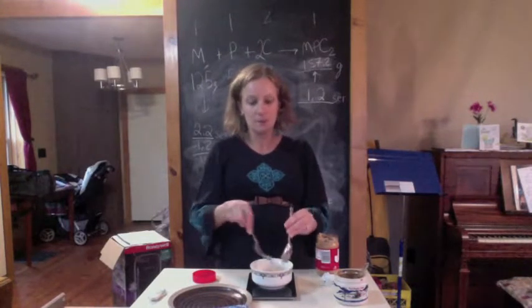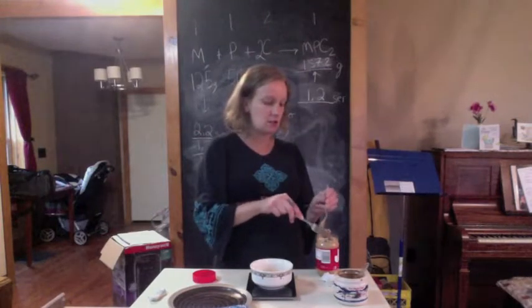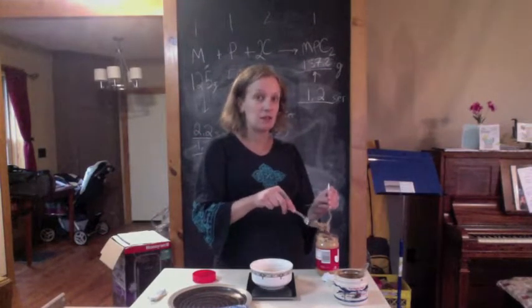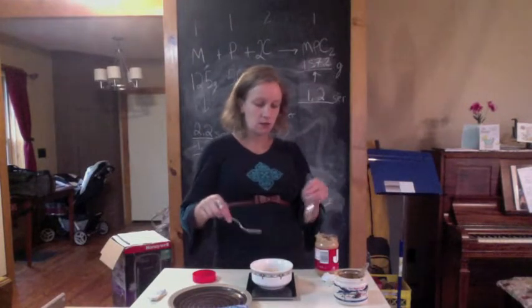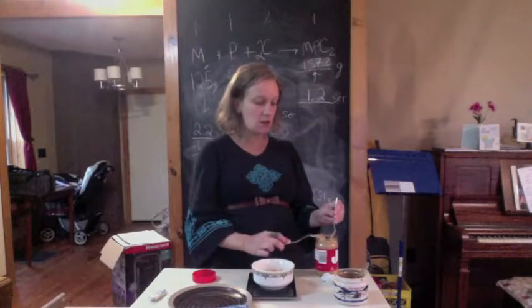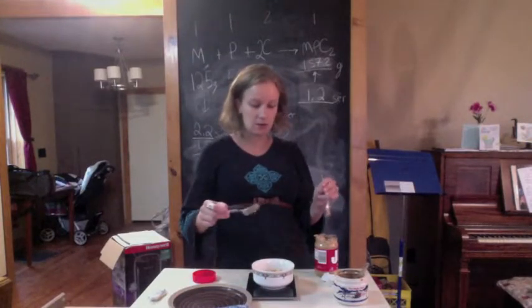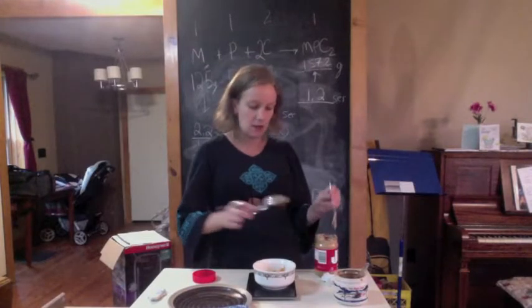You don't want to be taking powder away from your sample dish and trying to put it back in your container because of contamination. At home, as long as you know that your utensils are clean, you don't have to worry as much. But putting it back into the container in the lab is a no-no, so you want to measure very carefully, adding a little at a time, not having to actually take it away.